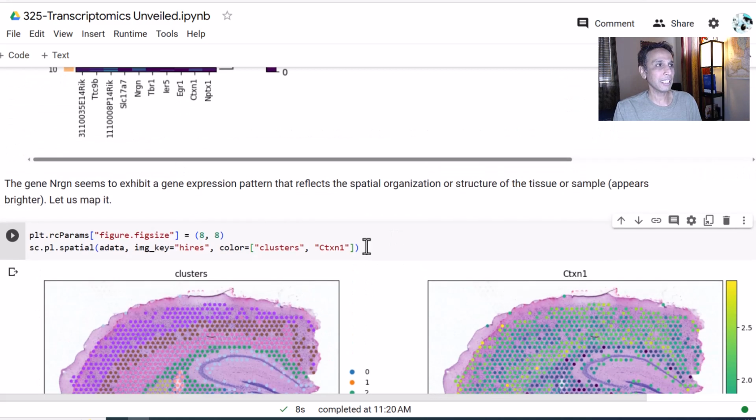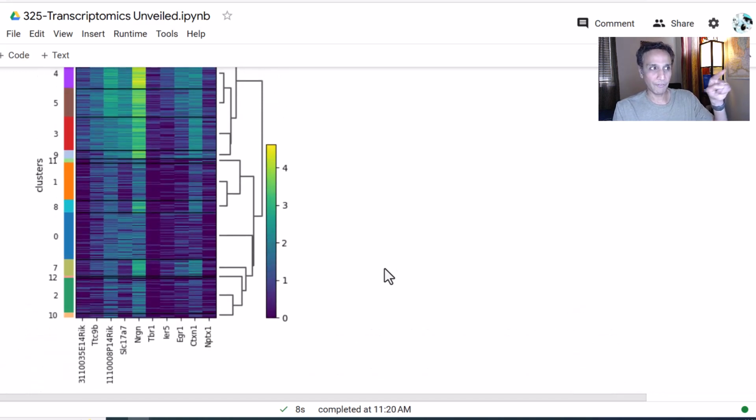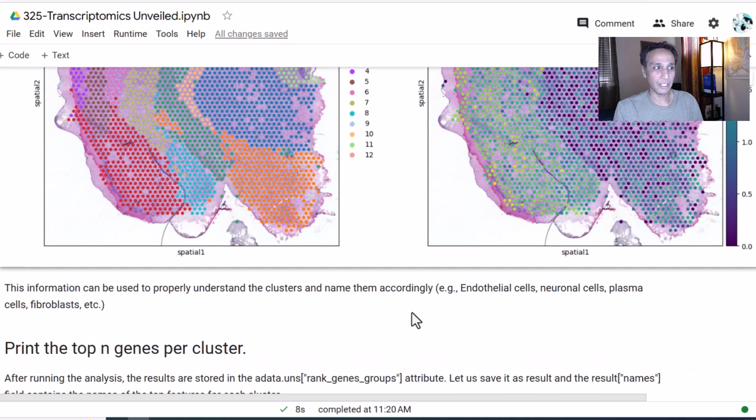Okay, play with this and change this. This is where you need to iteratively go back and create a different number of clusters. Maybe you don't know what the optimal number of clusters is, right? By looking at it, you get an idea, but this is where you spend some of the time. You go back, change the number of clusters, and come back and look at exactly what's happening, and then get a good understanding of how you can map these clusters spatially here.